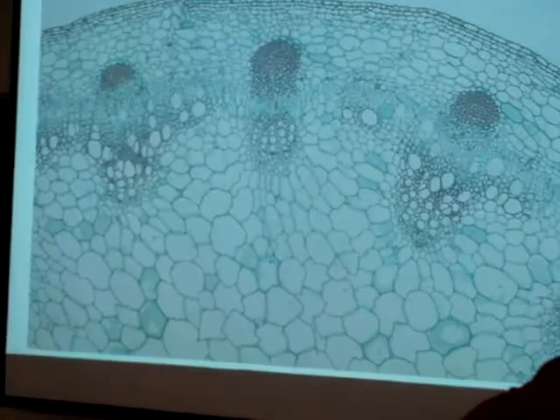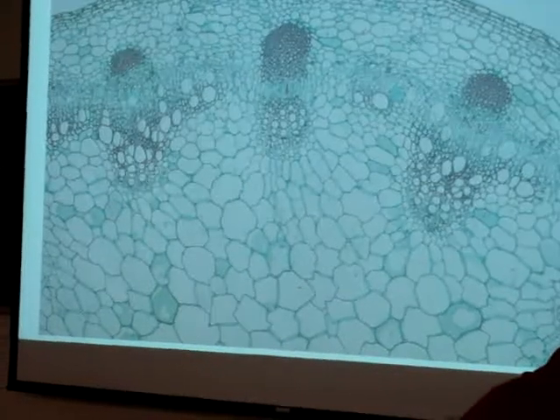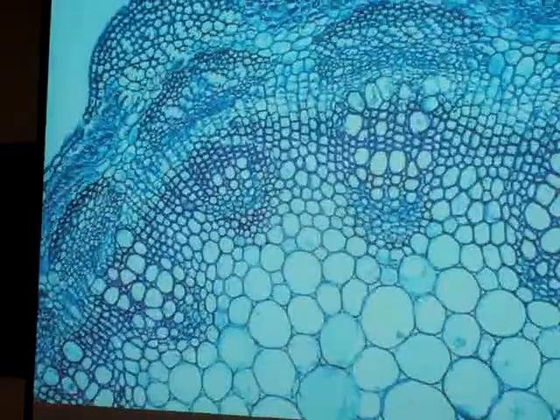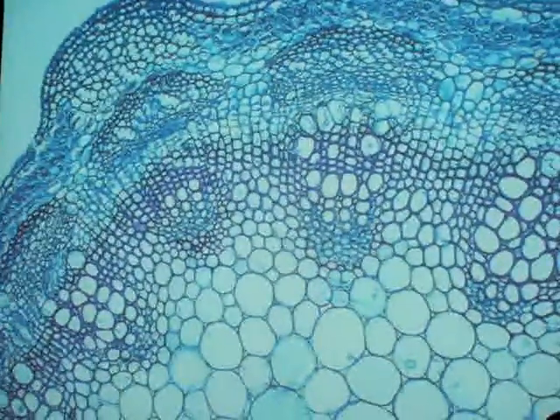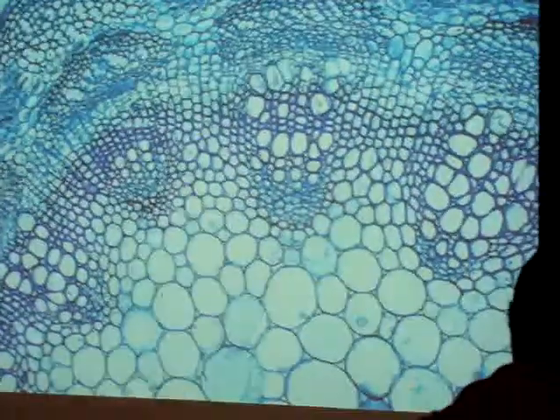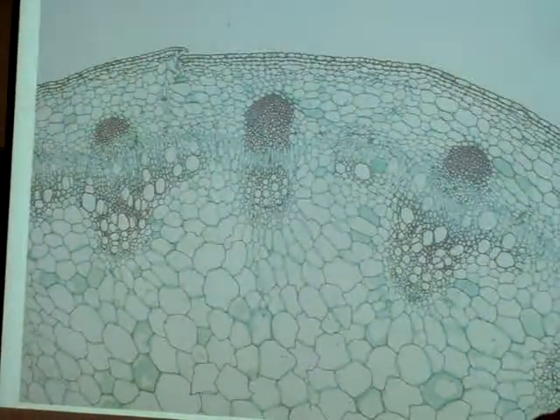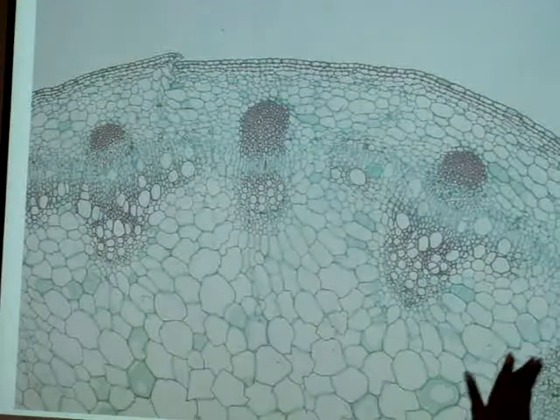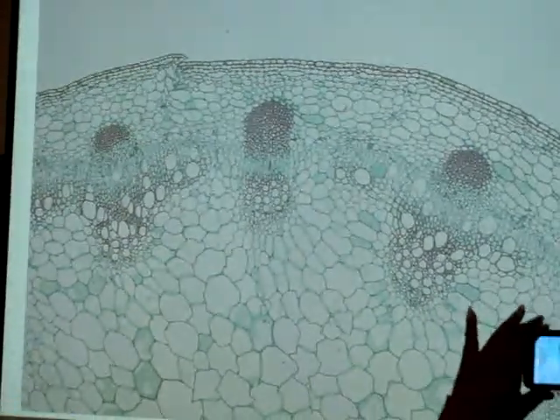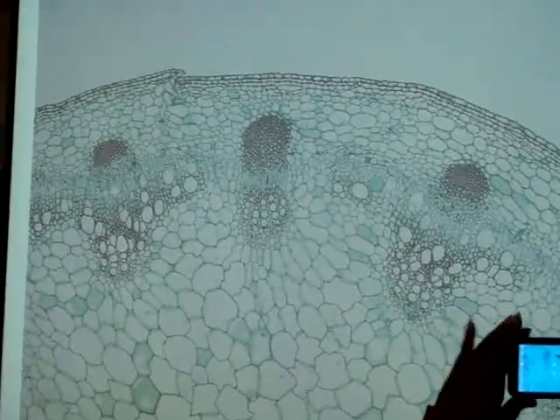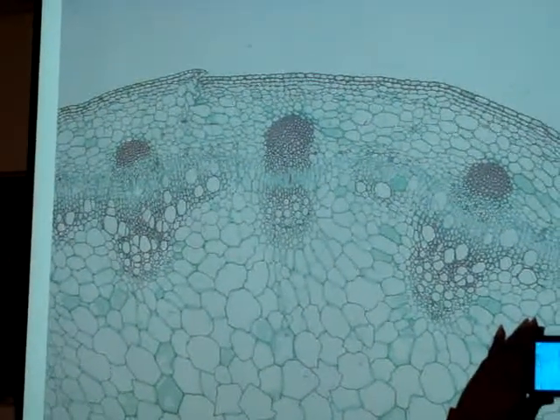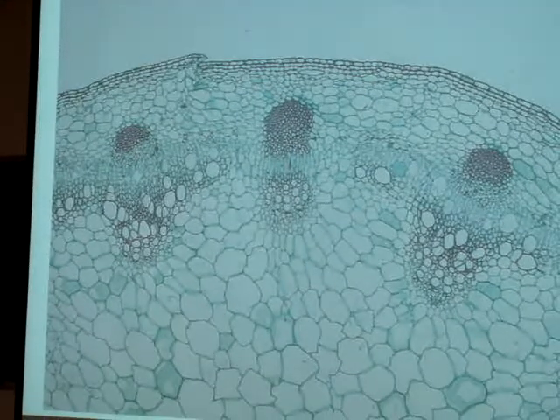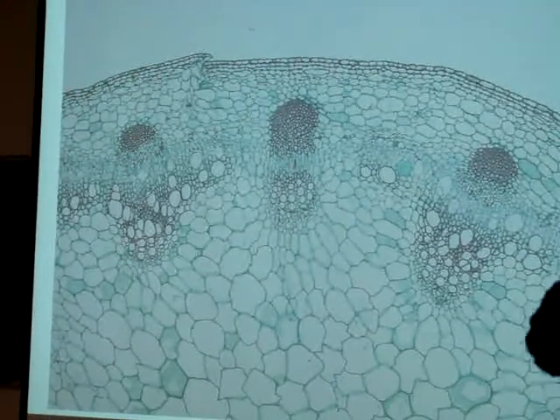More of the same. You bored with the herbaceous dicot yet? I like this. Those of you who are taking pictures, that's probably a good one to take a picture of. Which one? This one. It's just nice and clear. It's nice and clear and in focus, and you can probably get a good photo of that. Which one's this one? This is herbaceous dicot again. We have lots of repetition on these slides.